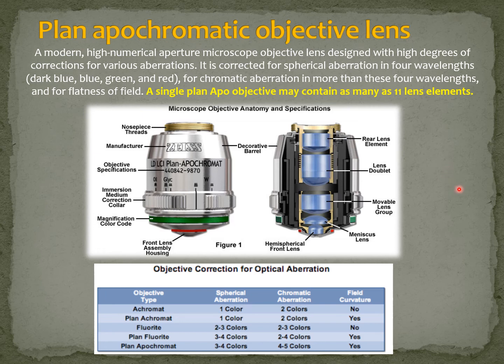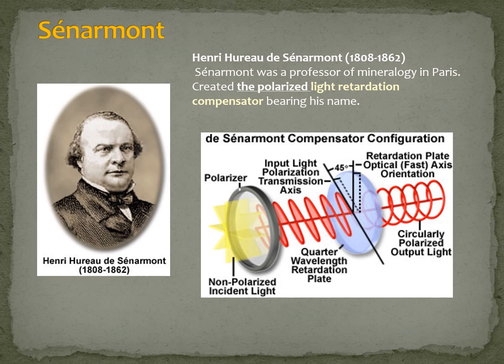Just to remind you that these different aberrations that light can suffer when going through glass were all described by the late 19th century, and manufacturers have been trying to correct them ever since. One of the problems that light can create for the observer is that the waves are not all incident on the sample with the same angle of rotation, like you can see in here.